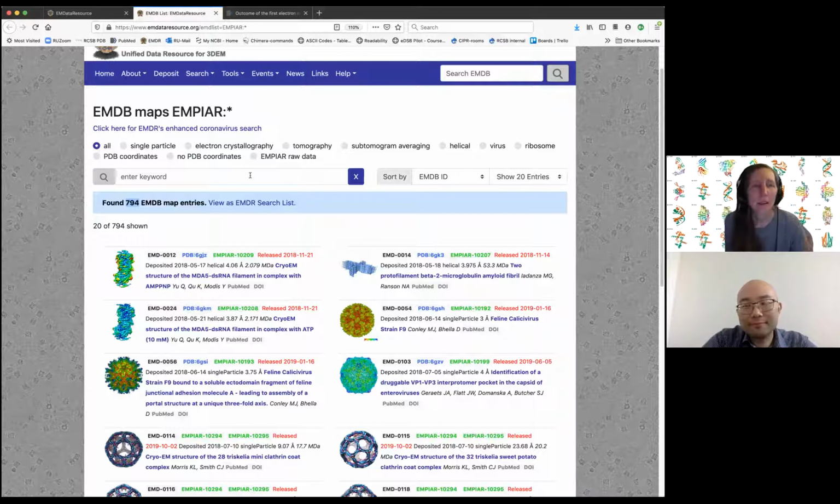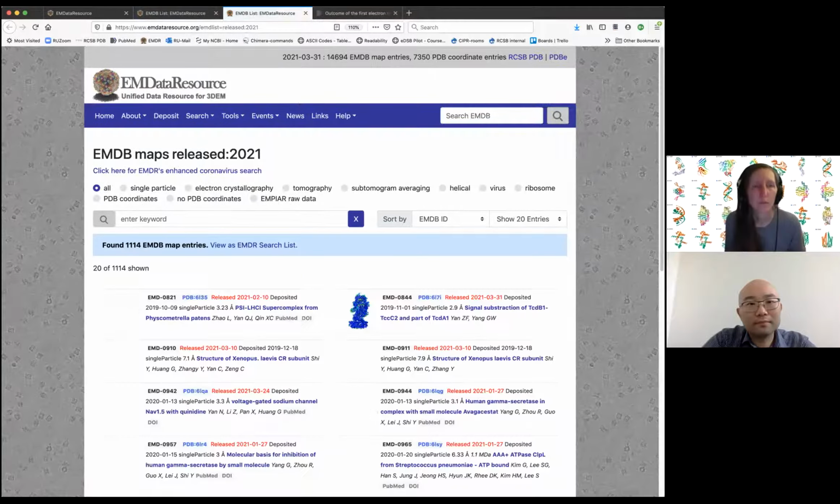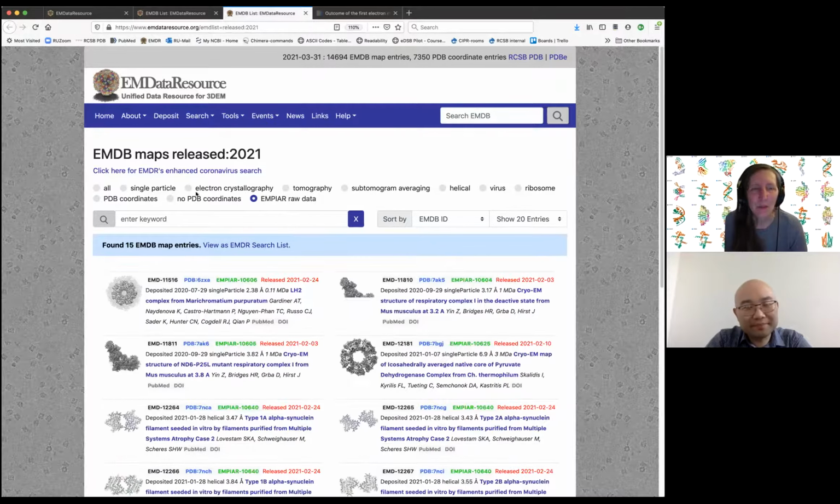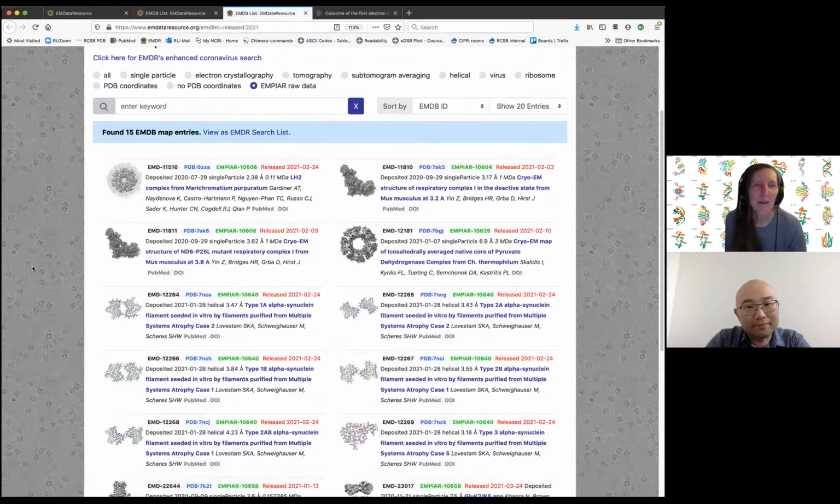And if you were looking for something else, like the latest entries, wow, there's already been more than 1,000 maps released this year. That's amazing. And 15 of them have EMPIAR raw data.